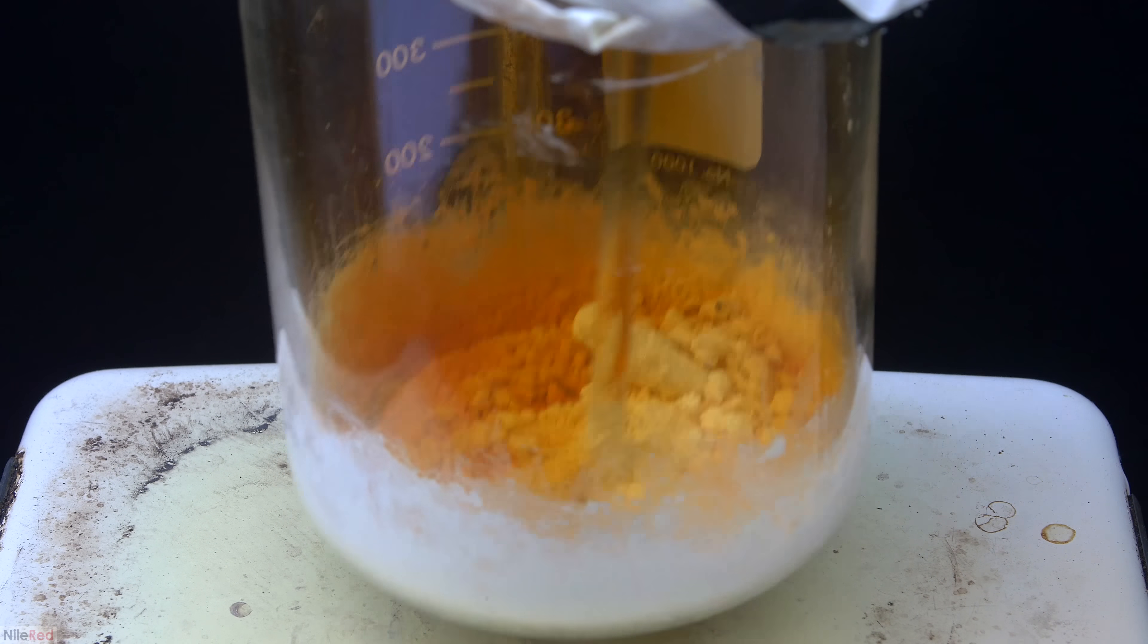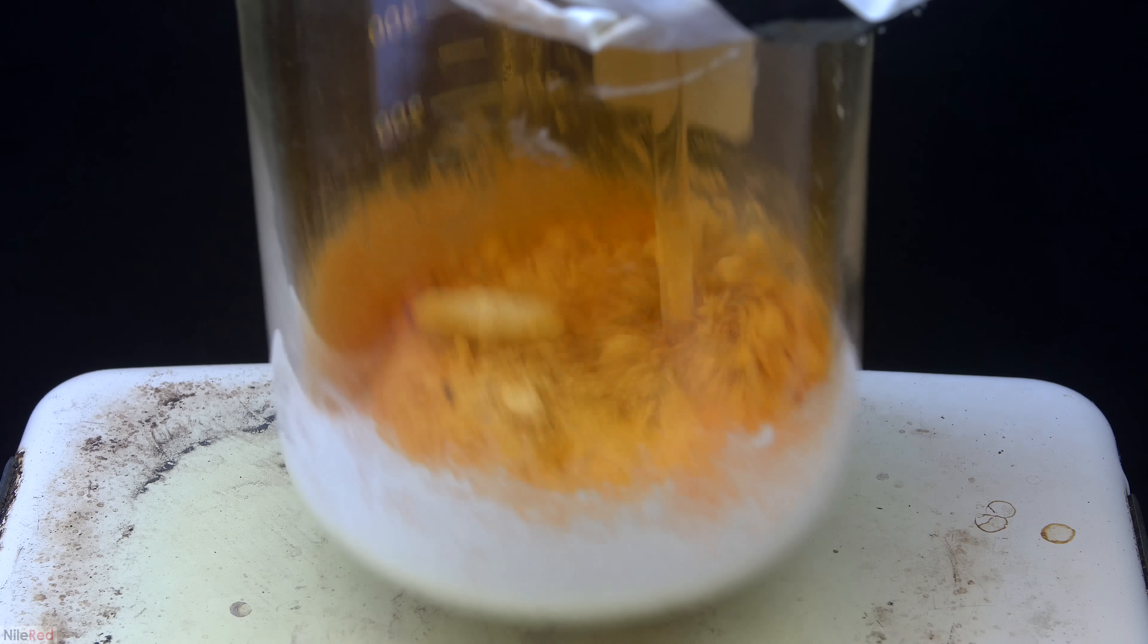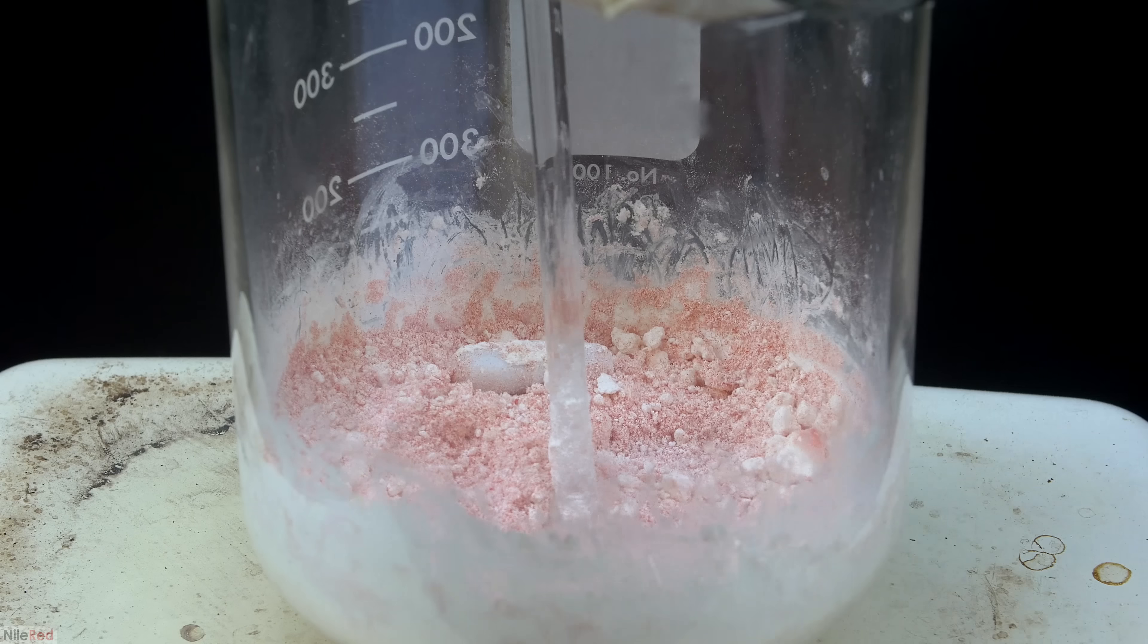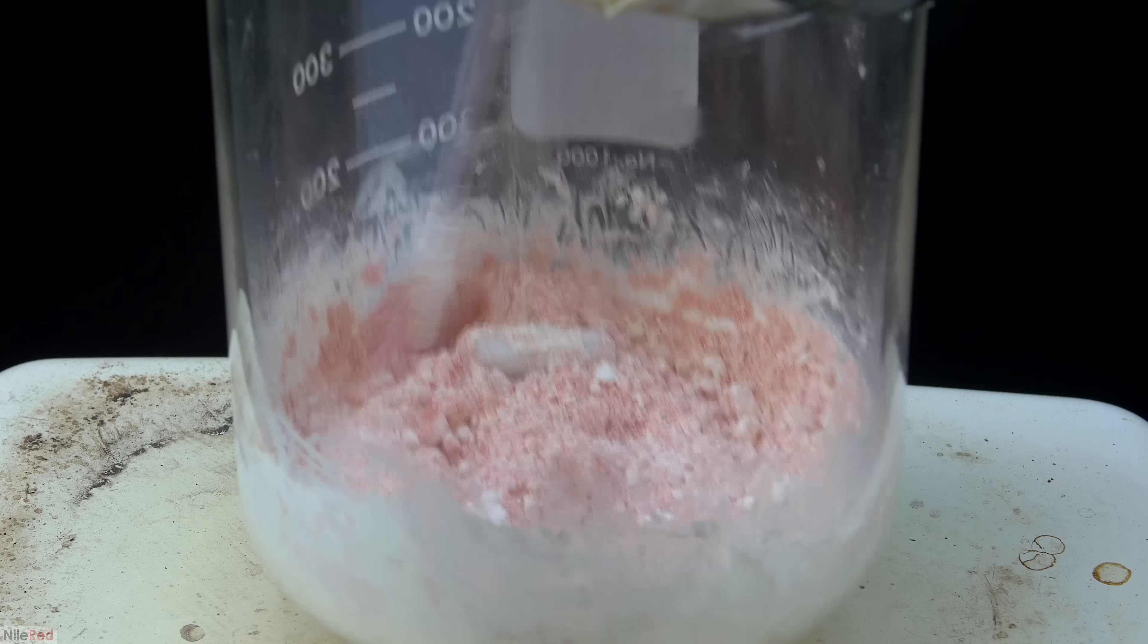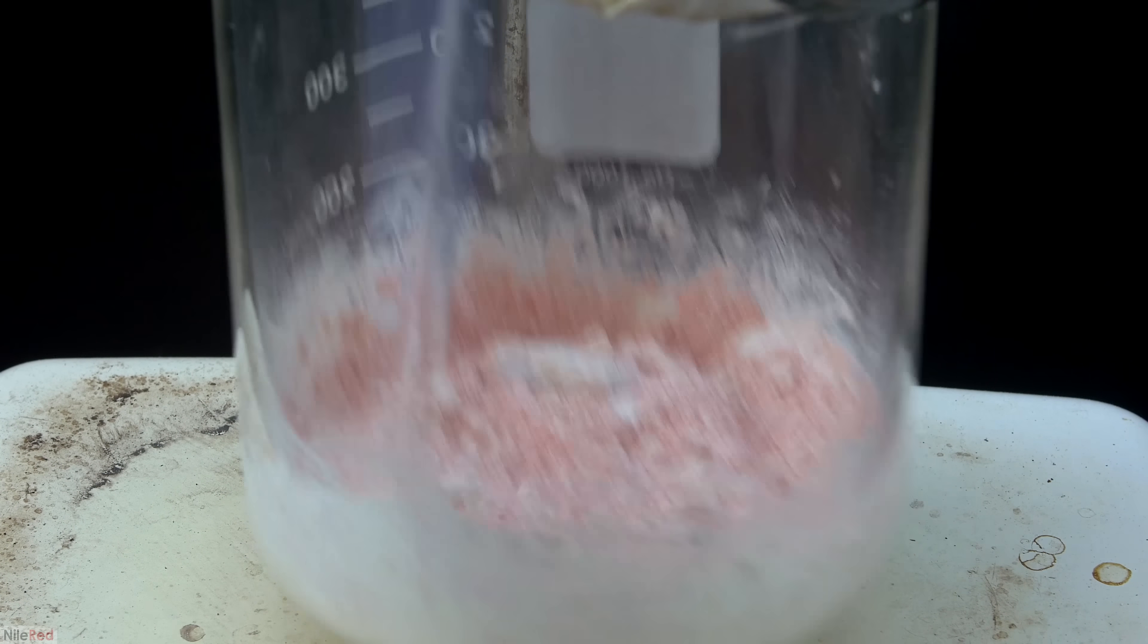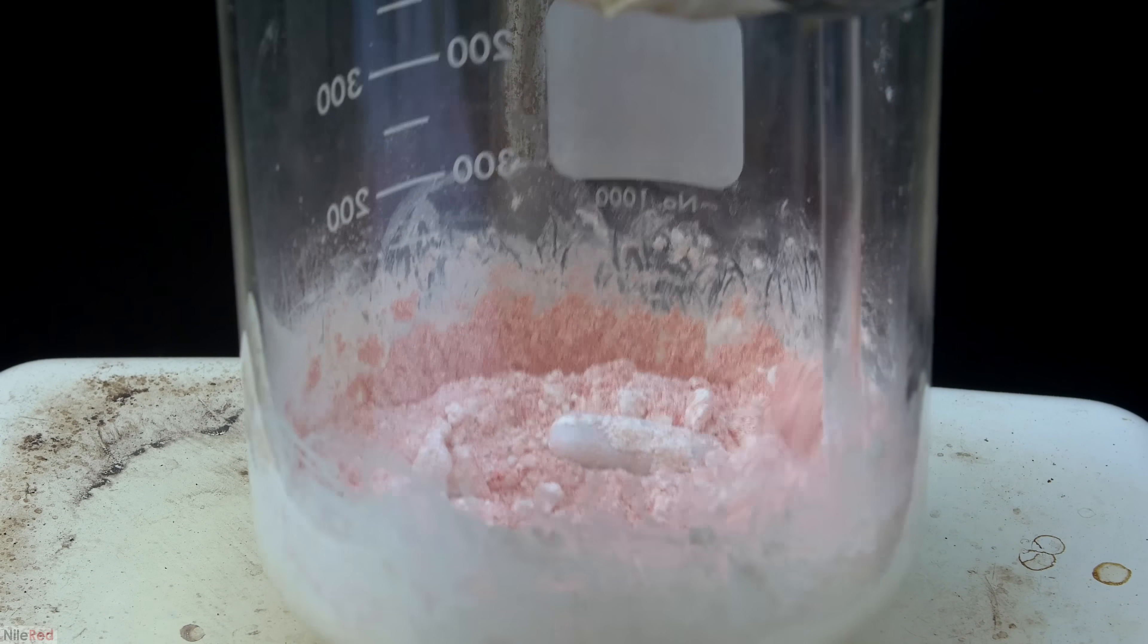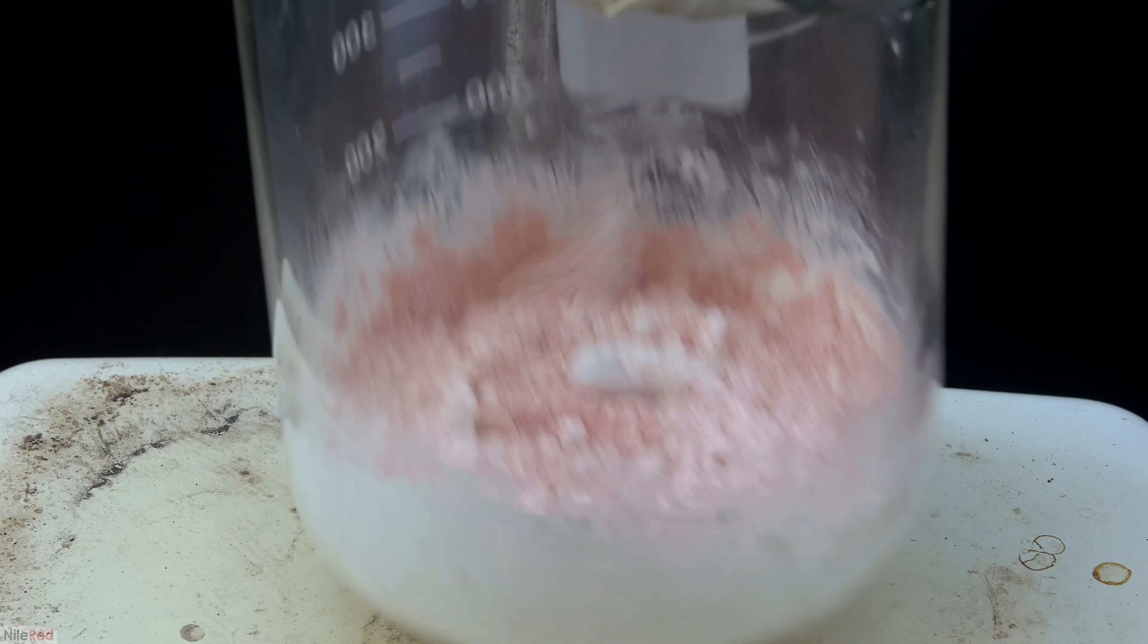So for this new method, I need aluminum isopropoxide, and to get that, I need mercuric chloride, and this is why I'm making it. Other than making the aluminum isopropoxide though, I don't have any real plans for the mercuric chloride. If you guys have any suggestions or cool ideas on how I could use the mercuric chloride, I'd love to hear it in the comments.